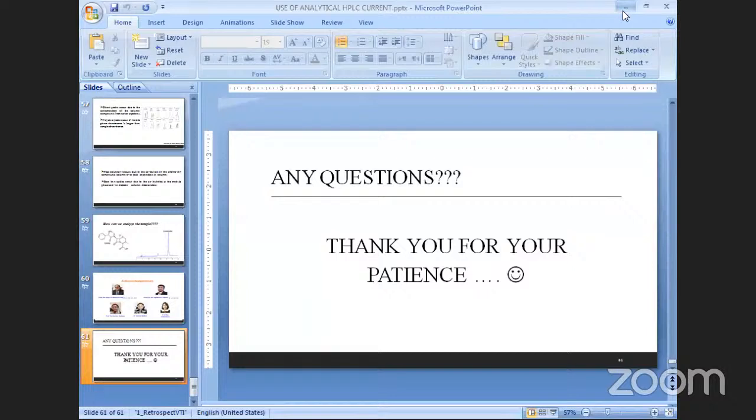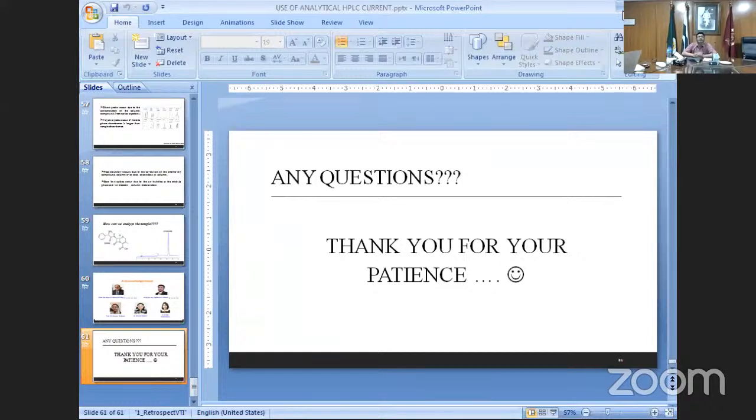My aim is to show you how the HPLC software system functions.